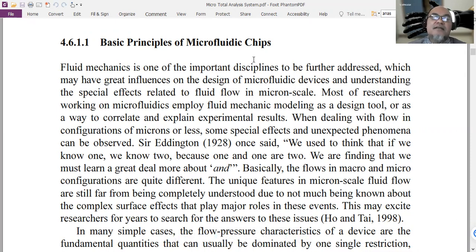In that case, from the physics point of view, they will have laminar flow because the Reynolds number is very small. Reynolds number is a parameter, a dimensionless parameter in fluid mechanics. Yeah, if the dimension of the pipe tubing is large, then you will have high Reynolds number, where you could have turbulence. The turbulence is the swirling of liquid inside the pipe.